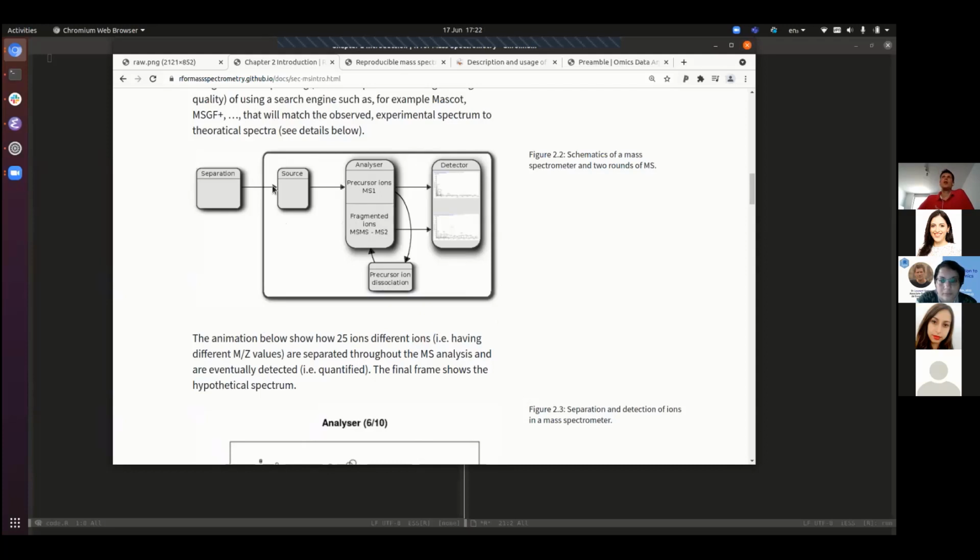In terms of proteomics, we will have way too many peptides, because we study peptides, even though it's called proteomics, the material that is analyzed and acquired in the mass spectrometer are peptides. There are way too many peptides in a normal biological sample to be analyzed by direct injection into this mass spectrometer. So the first step is always a step of separation.